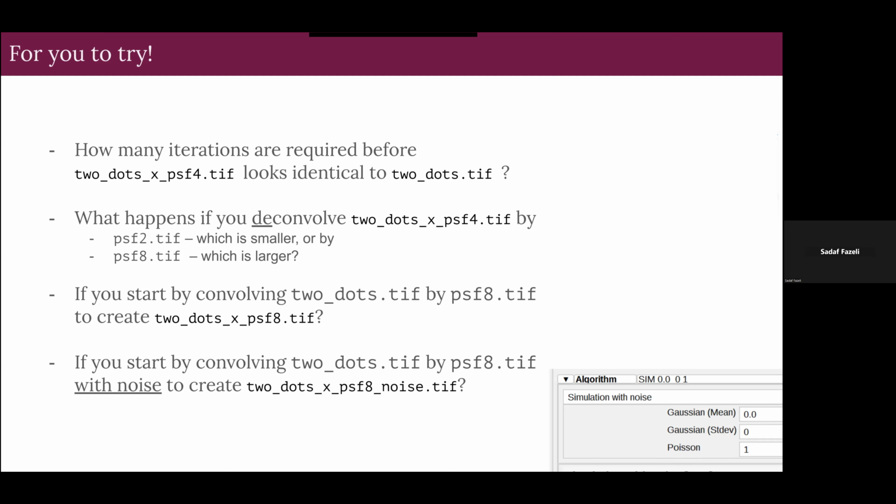Sorry, can I ask about the algorithm that we used for the first image to convolve it? What was the name of the algorithm again? Convolution is a standard method that you find in mathematics. So it's just called convolution, and typically it's done in the Fourier domain. Something you will talk about later today, maybe. Yeah, tomorrow. Oh, tomorrow. Okay, maybe not for this purpose.